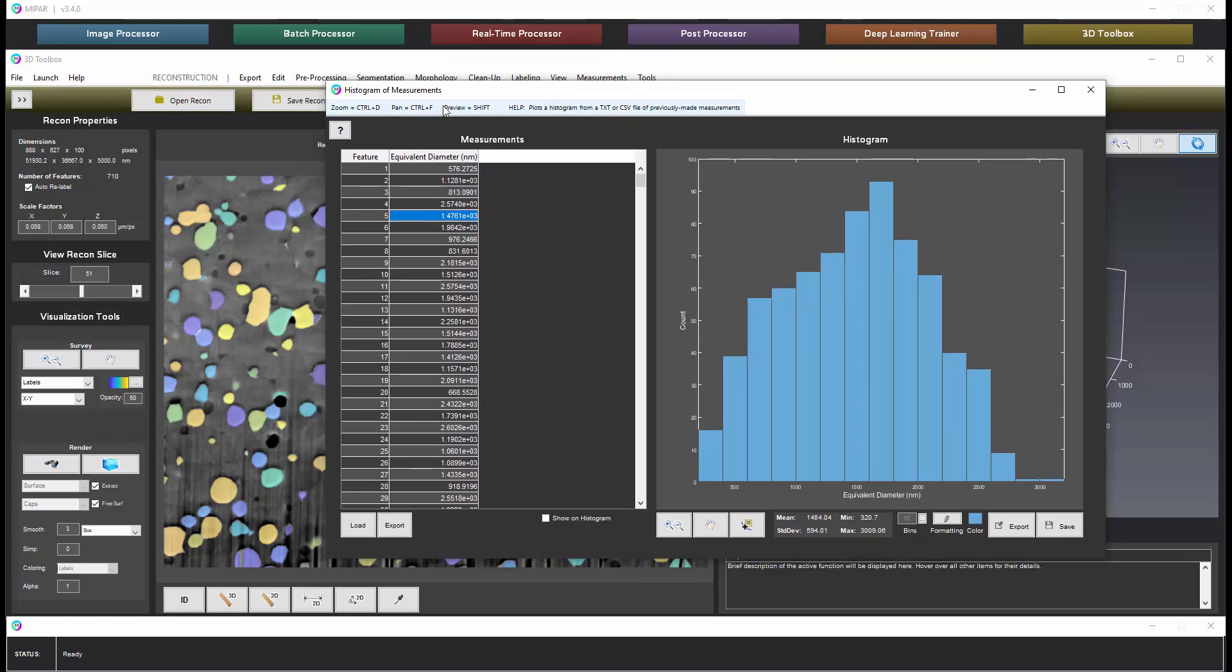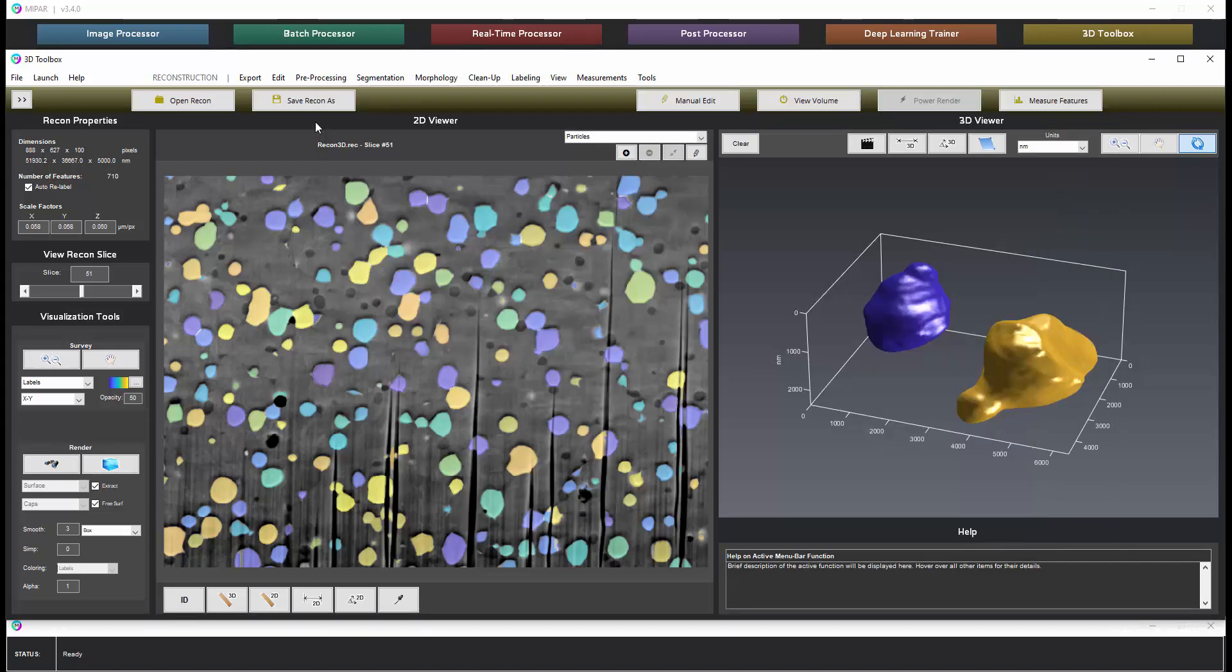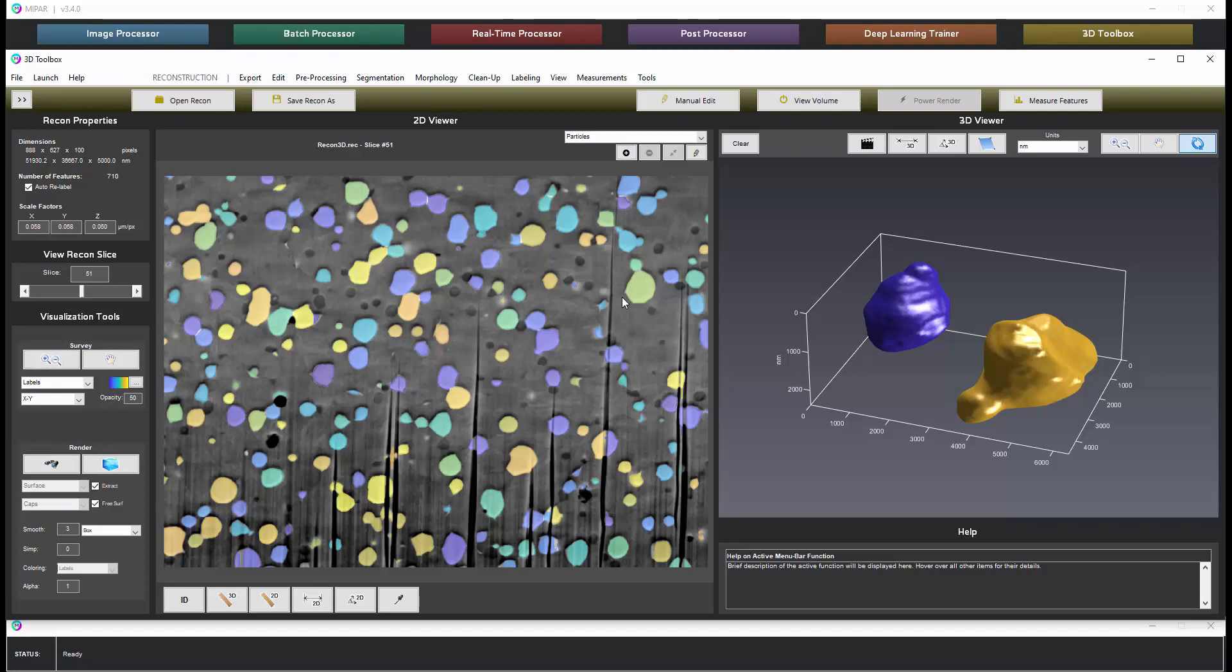So that's been a brief demo of reconstructing a dual beam FIB 3D data set from start to finish in MyPAR. Thank you very much for your attention and for being a MyPAR user. We look forward to helping you.